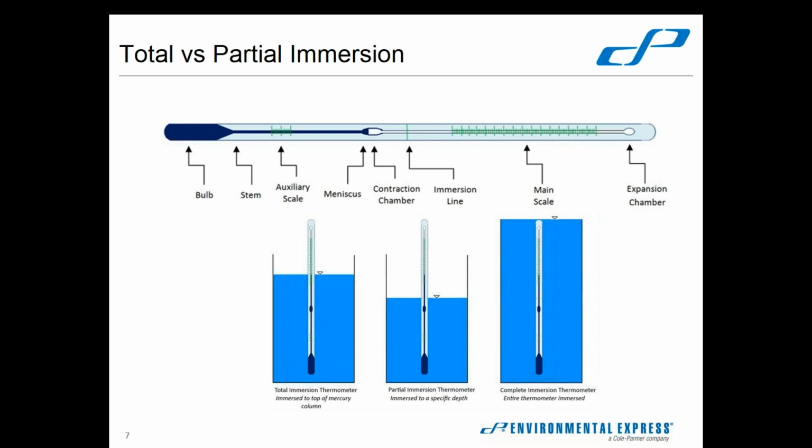And it makes a difference because the actual thermometer itself has some measure of expansion and contraction based on the temperature that the thermometer experiences. And so it is calibrated so that that line takes into account the expansion of the thermometer itself.